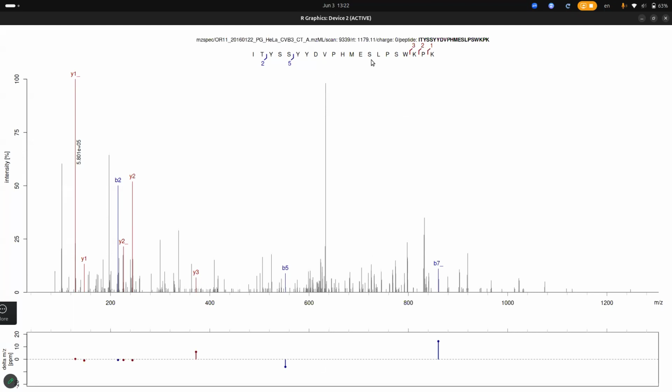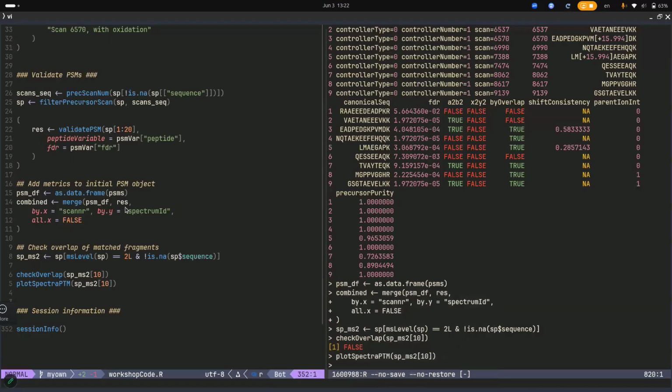Should we not try to apply phosphorylation and see if you suddenly get more matched peaks? So it's a metric that can be used as an alarm bell when you've run a search engine with a few modifications, but you might want to try some other ones.